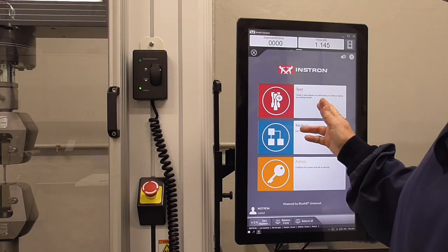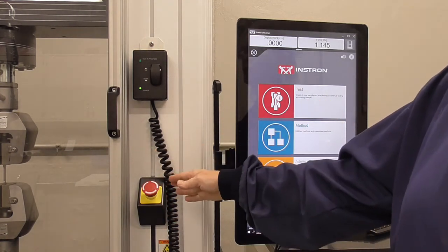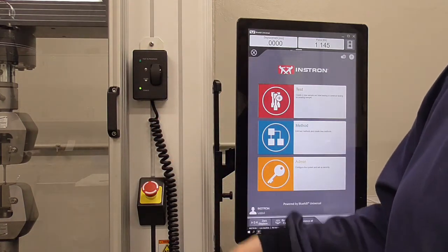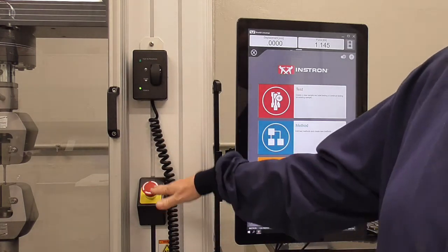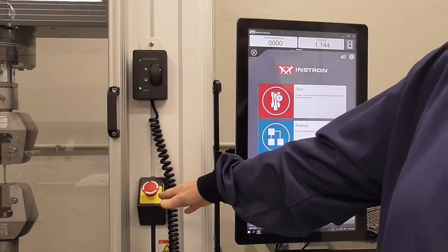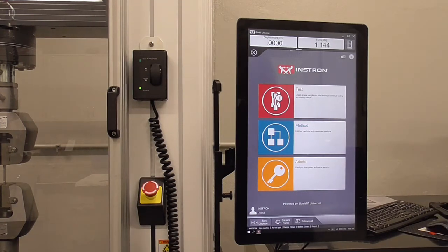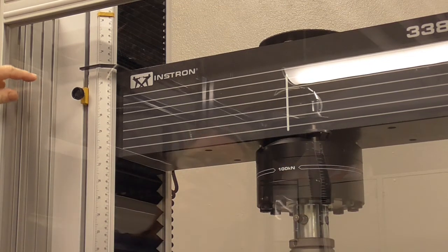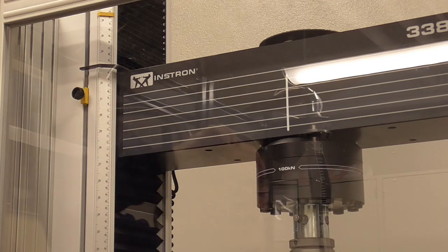Notice the emergency stop button. At any time you feel the machine is going to crash or samples are going to collide, just hit that — it's no big deal to recover from an emergency stop. We've also set these emergency stops so that if the two grips were about to collide, the machine will stop automatically.